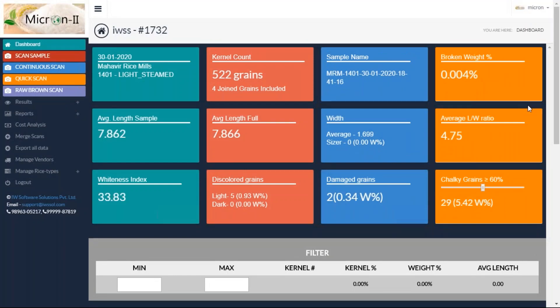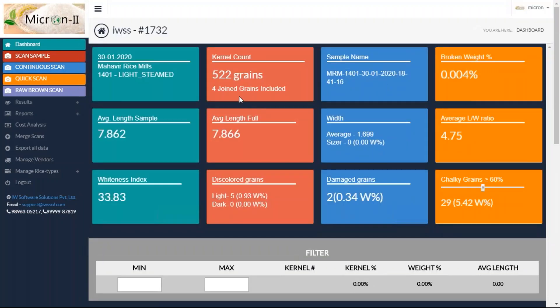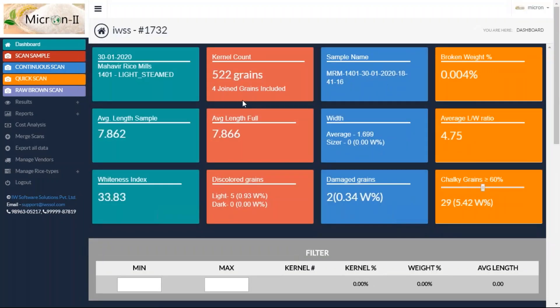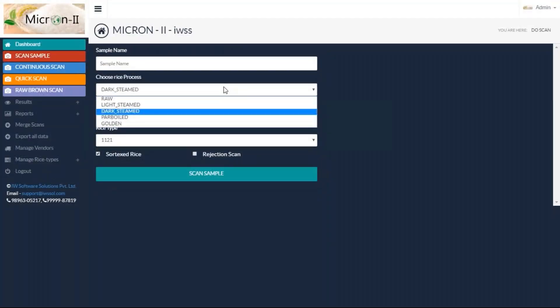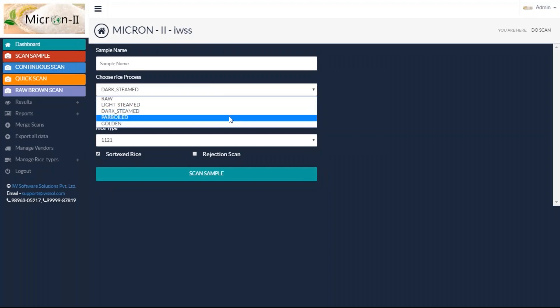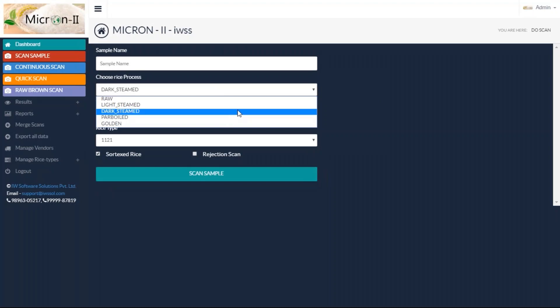When I put in my key and enter into this software, I get to see the last scan that I did on this particular computer. I'll detail those scan results later. Right now, let's learn how to do a new scan. You click on scan sample and choose what rice process — is it steamed, parboiled, golden, or raw?